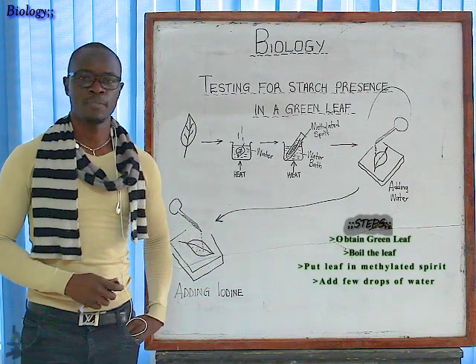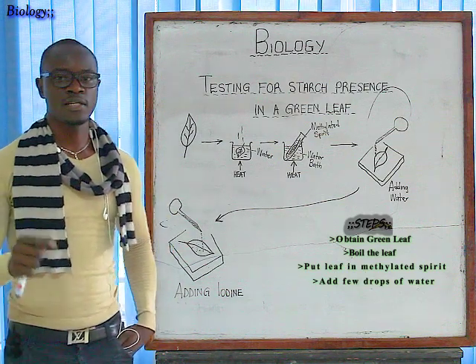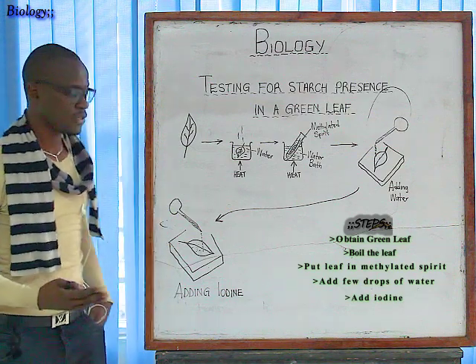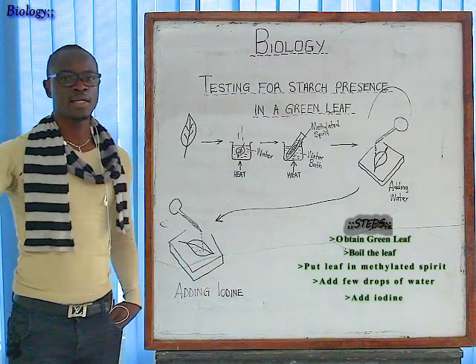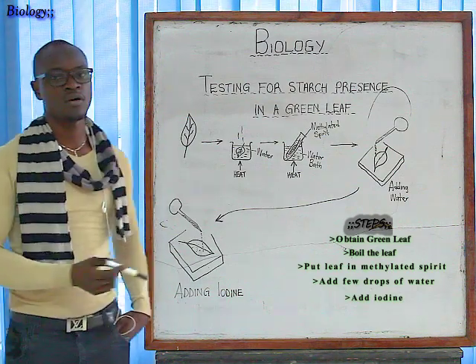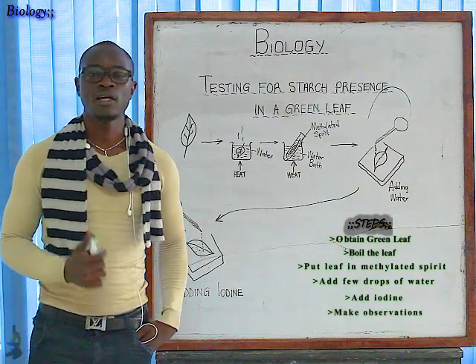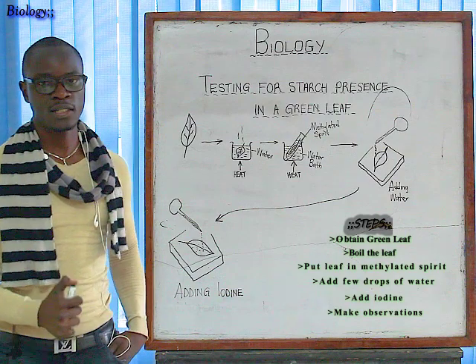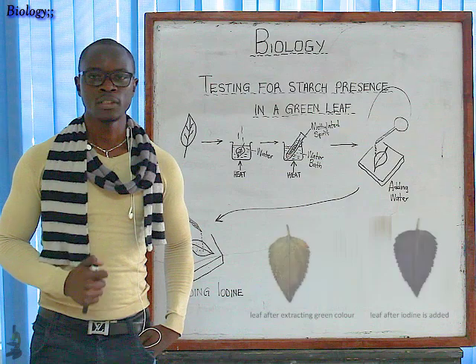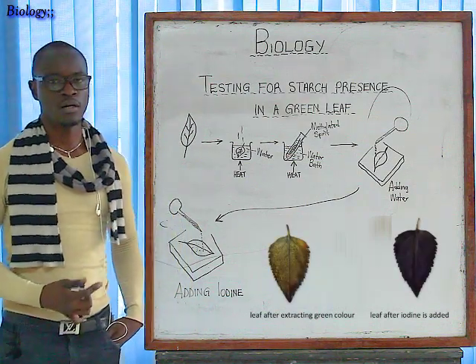For the last step, to determine whether starch is present in our leaf: take the leaf from the white tile, place it on a new white tile, take a clean dropper, get iodine, and pour two to three drops of iodine on the leaf. Then wait to see what happens. The regions that have starch will cause the iodine color to change from brown to blue-black. The regions without starch will remain brown in color.